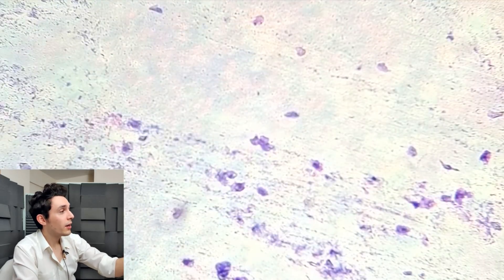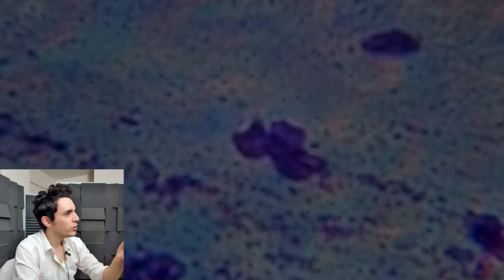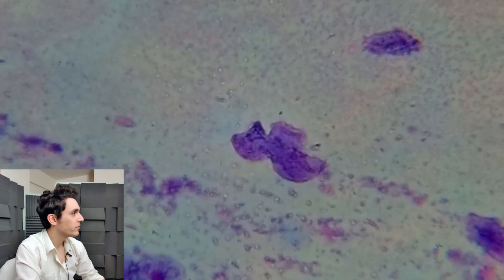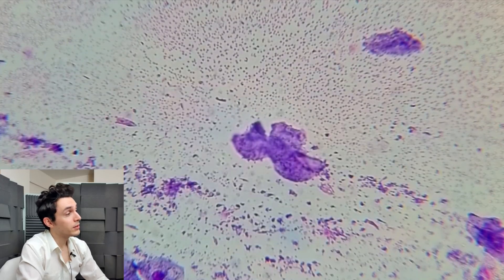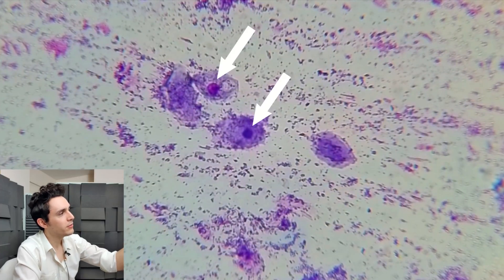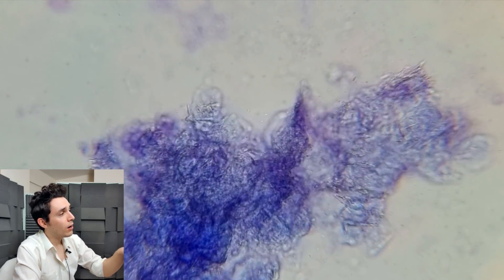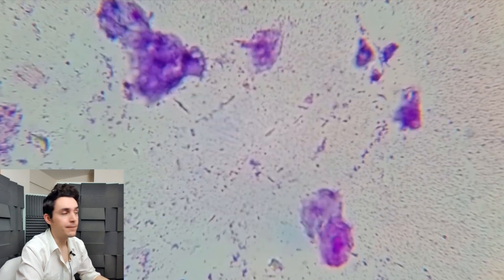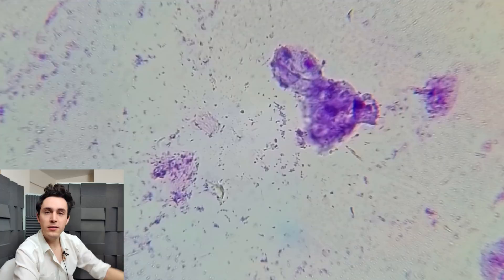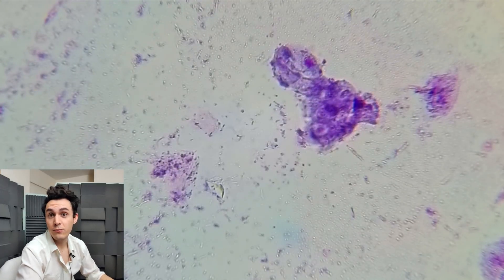Giemsa stain turns things a kind of violety-purple-bluish colour. We can see a lot of skin cells and lots of debris — the bluish speckly stuff is cellular debris, bits of skin cells, and there's lots of bacteria on the slide as well. Those two little circles inside the fried-egg splodge are the nucleus of the skin cell. These are squamous epithelium — squamous means squashed like a pancake or fried egg, and epithelium means skin. The pink circle inside the cell is the nucleus, which contains the DNA, and it stains differently to the cytoplasm.